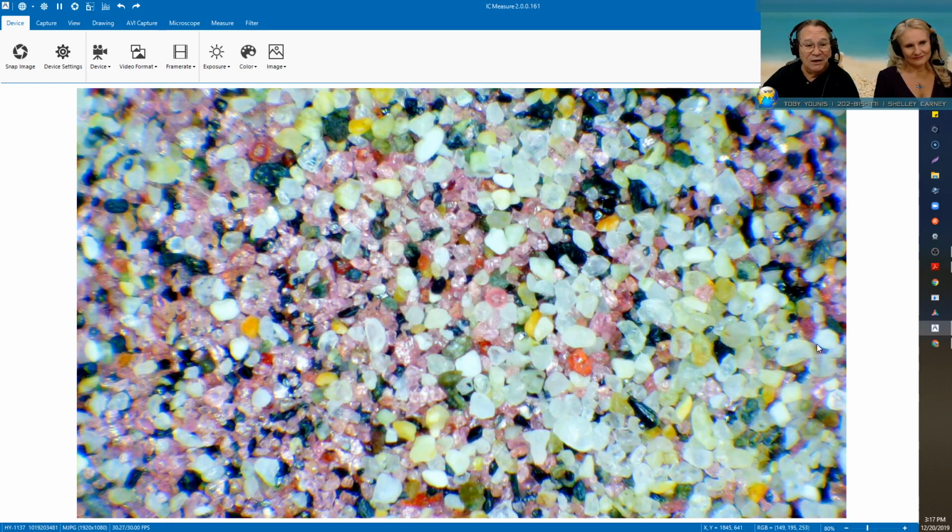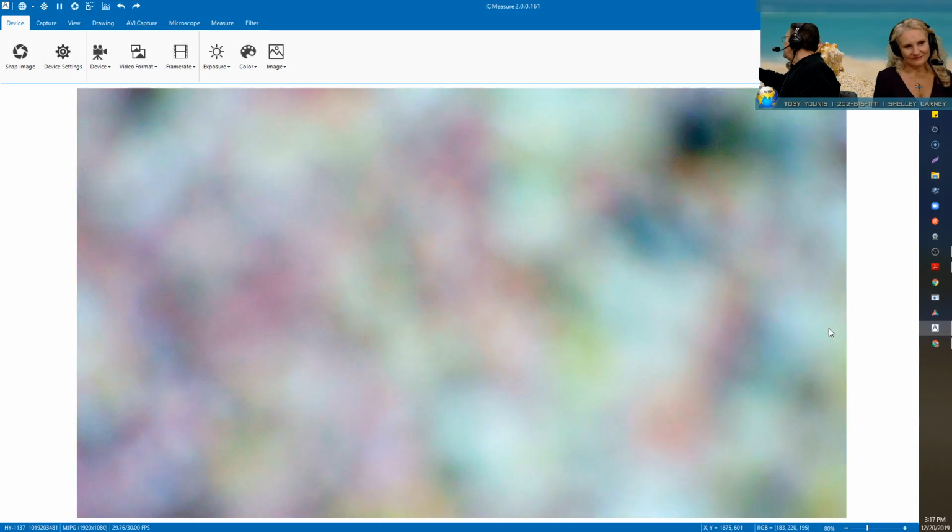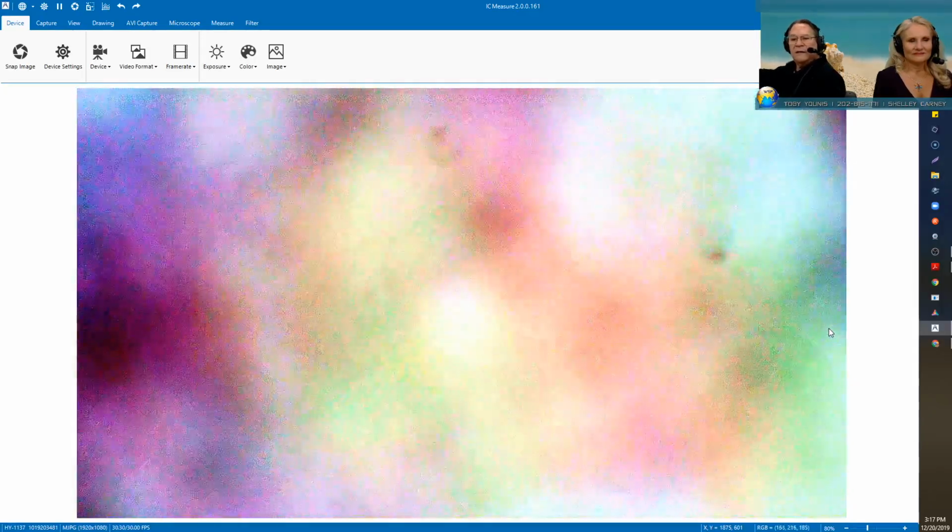So as you can see, there is a lot of color in it, different colors, and they're mostly translucent. There are some solids, some opaques in there, but there's a lot of translucent colors, green and the white and the pink and the dark red, which they refer to as purple. That one right there is almost purple. But let's zoom in about halfway now and take a look. I'm going to go to 2x and focus on it and get a little bit more detail from it.